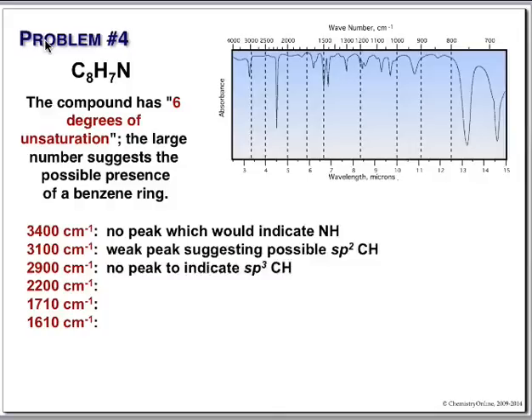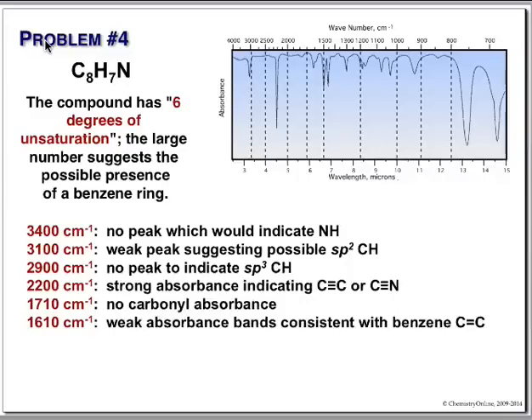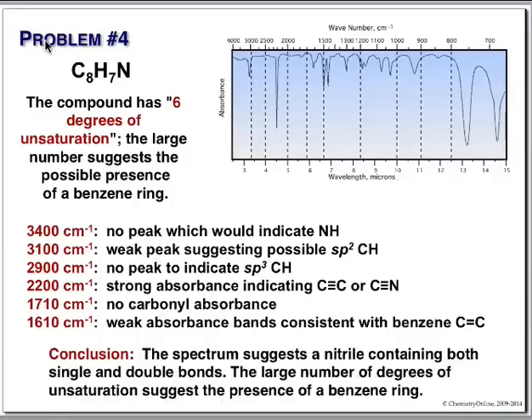Triple bond region. Oh my goodness, look at that sharp little peak. After you've done this a while, once you realize your thing has nitrogen, you would look at this and say, oh my goodness, that's a nitrile. Sharp, clean, right in the 2200 region. Carbonyl, nope. And finally, 1600 on down. Well, there's something there, there's something there and there. Yeah, they're there, they're not real impressive. But we could at least say weak bands, consistent with, or suggest, or could be, or I think. So this looks like we have a benzene ring and we have a nitrile.